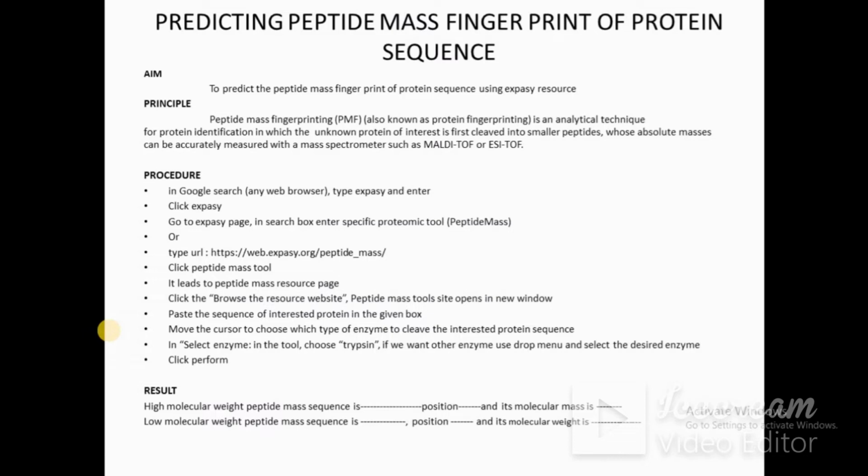So what is Peptra? We just have to submit the protein sequence and it will draw the peptides. We have to give a primary sequence. It will form linkages for the given protein sequence and form a peptide structure image. That tool is Peptra.